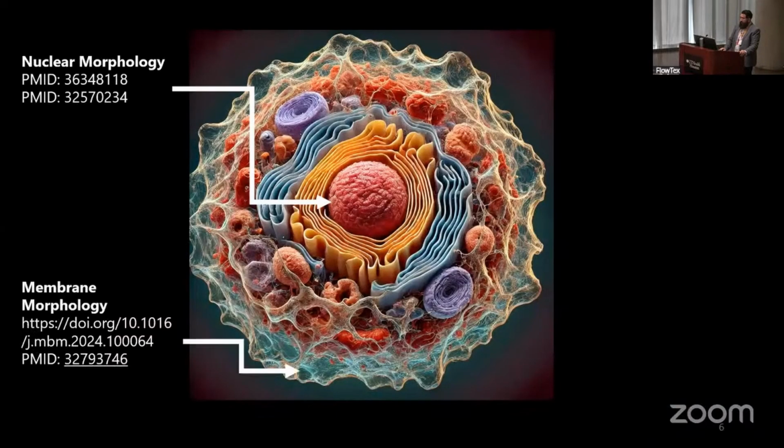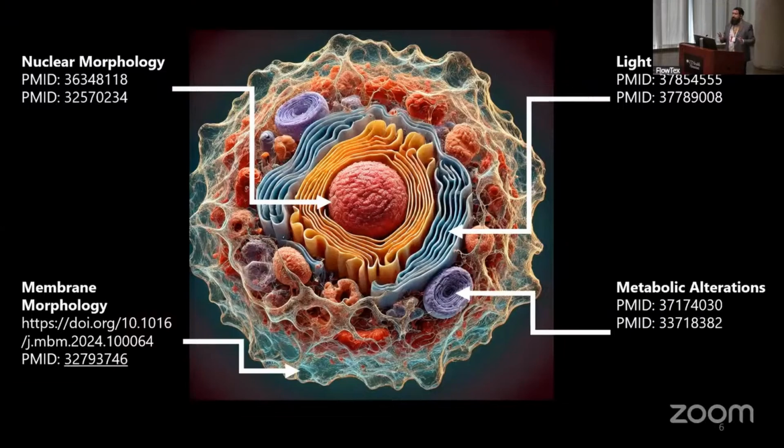So I wanted to put this up here. Not all of these papers are going to be imaging cytometry based, but there are bioimaging papers that connect the image features from the nucleus, the membrane, intracellular organization, and even metabolic alterations just using different imaging techniques. So there is a real connection between morphology and cell physiology, and we can track these changes in disease and gain information about this that we didn't have before, beyond the EMT, the classical thing you see in cancer.